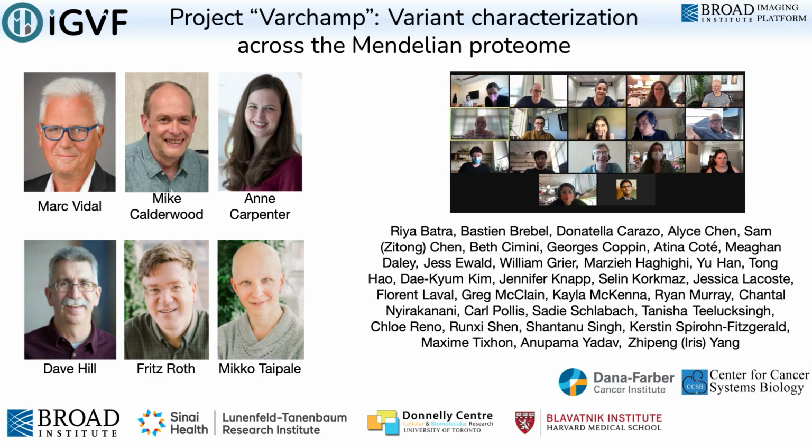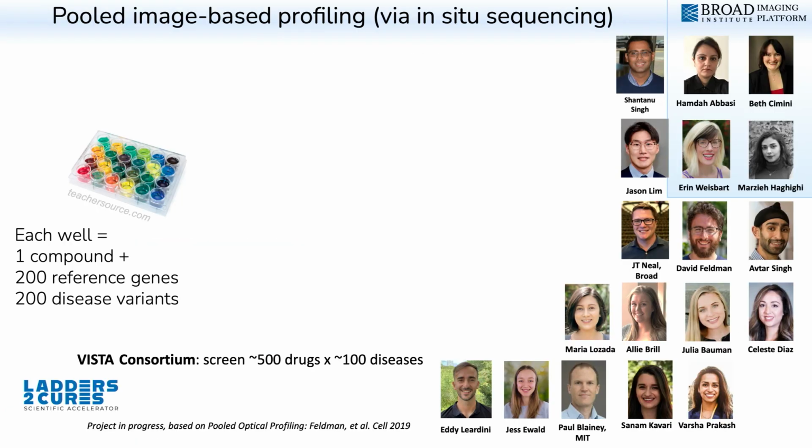Together with a bunch of friends around the US and in Canada, we are also now scaling it up about 20x to do about 40,000 or some large number more variants. And now we are faced with a new bottleneck, which is how do we do not just 200 drug screens, but potentially 4,000 drug screens, because you might want to do it for each one of these. For that, we turned to this technology developed by the Neil and Blaney labs down the road at the Broad Institute for screening them.